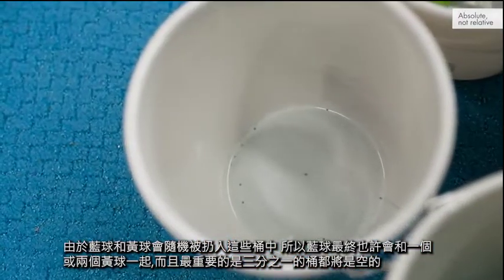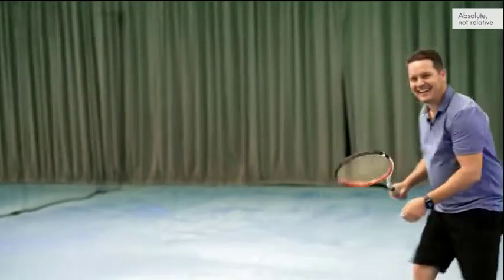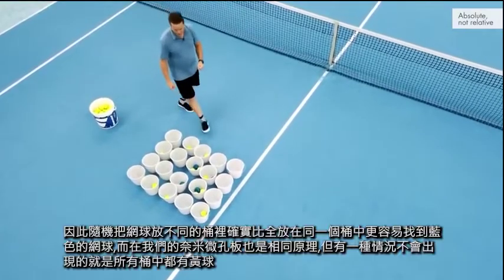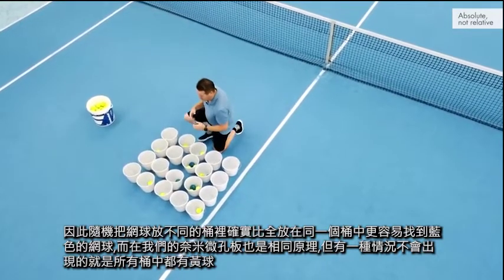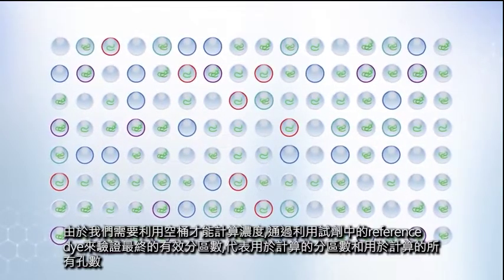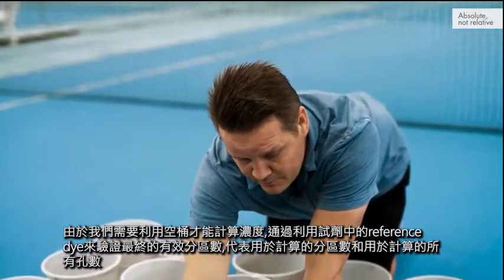So the partitioning, throwing randomly into partitions, has proven a much better way to find the blue tennis balls than in this situation. The situation we don't want is one where we have the yellow tennis ball in all the buckets, because we are using the empty ones to be able to calculate the concentration.